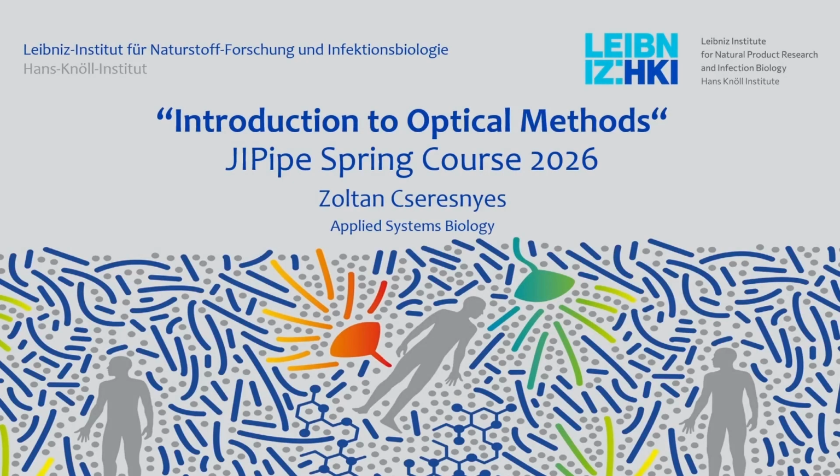And the idea of me starting with microscopy is that, in our experience, we have been teaching this for a long time now. If you don't have a basic understanding, really, of advanced understanding of microscopy, then on the one hand, designing your experiments will not be done optimally, or you will rely on help from somebody who may not know your biology.